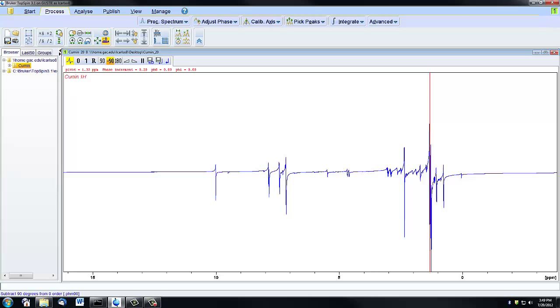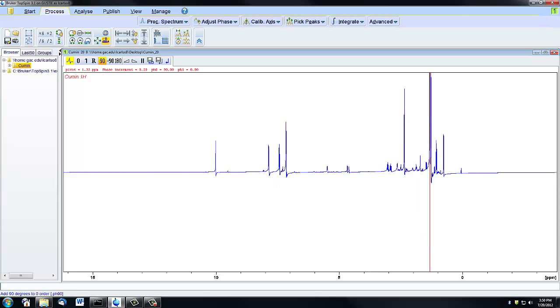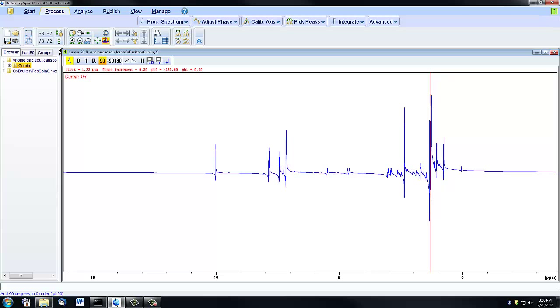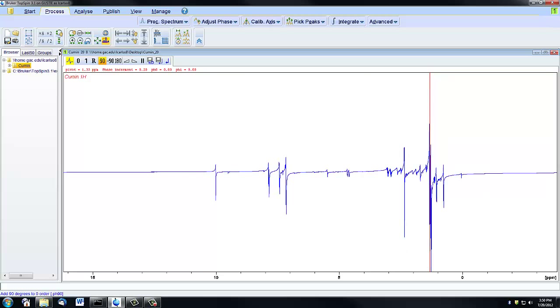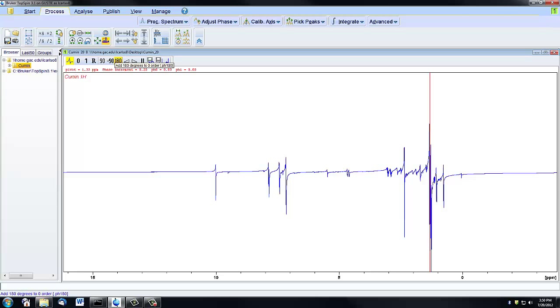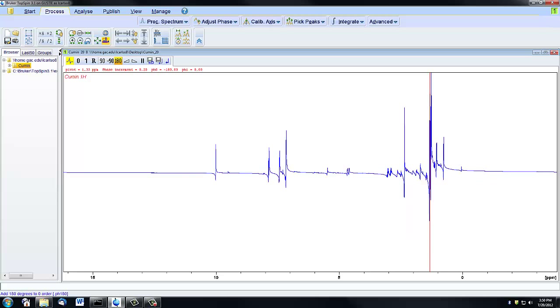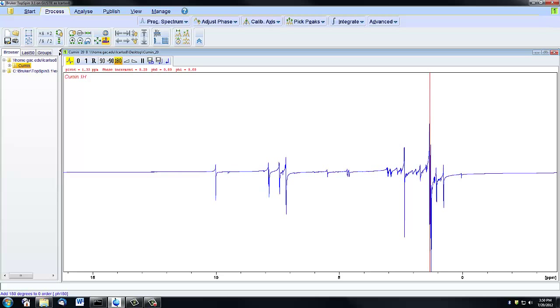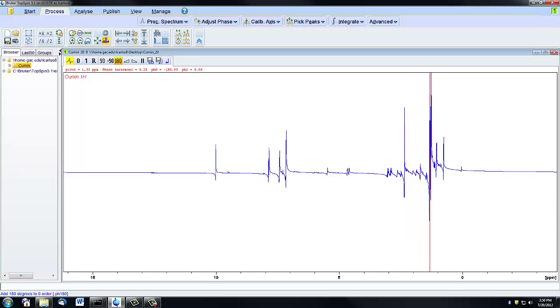These 90, minus 90, and 180 buttons will adjust your phasing by exactly that amount. If I push the 90, we're moving the phasing by 90 degrees. If I click this button four times, it should be back to where we began. Minus 90 is going to move in the opposite direction, and if I adjust the phasing by 180 degrees, the spectrum is going to invert itself.